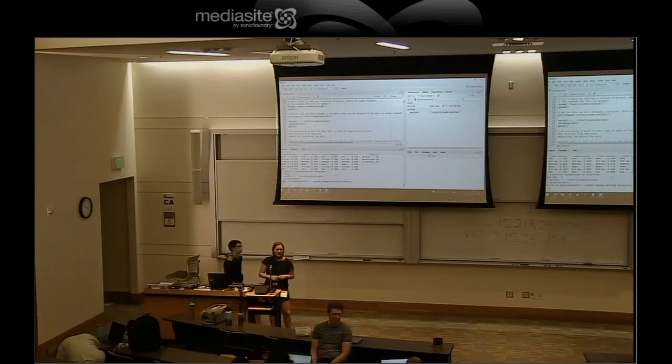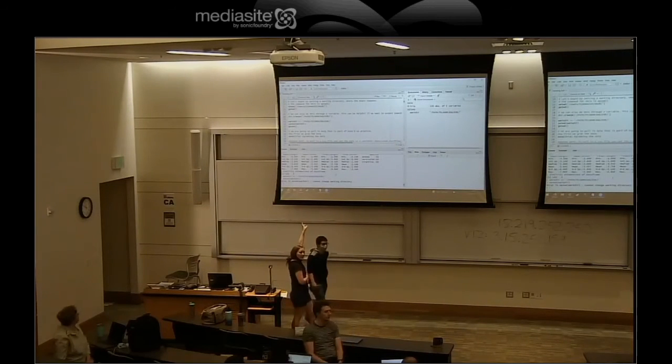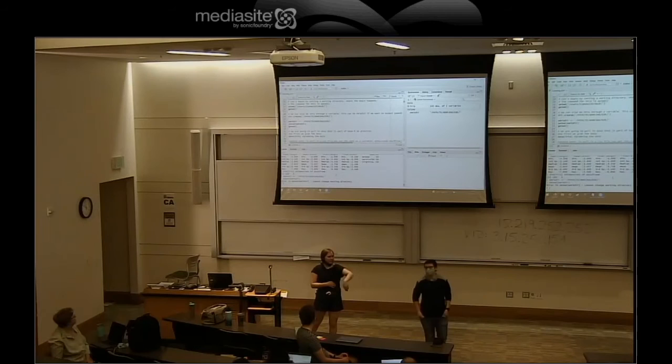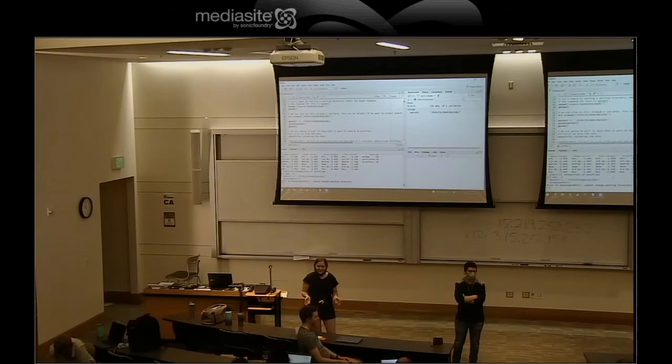If you got that red error, you can make your directory using dir.create and the path that you're trying to set as your working directory, then it should work. Otherwise it'll still go through, but once you try to save your first plot into your working directory, it won't work because that directory doesn't exist.